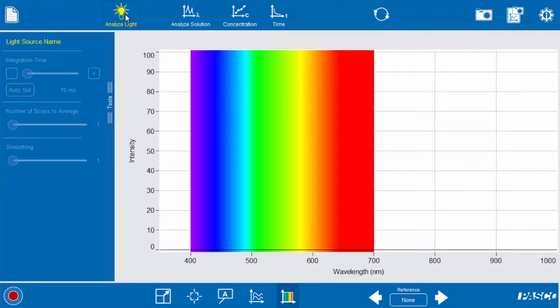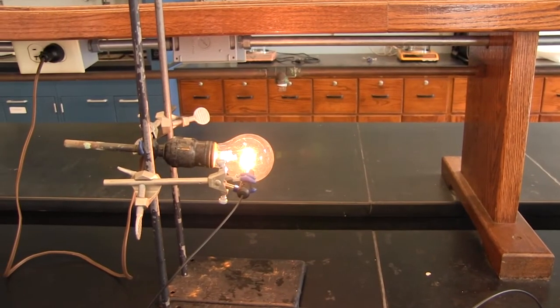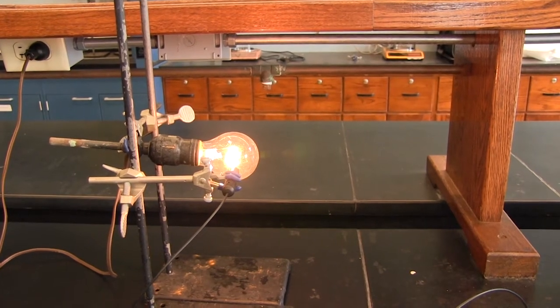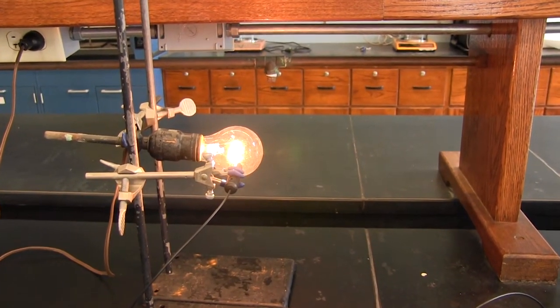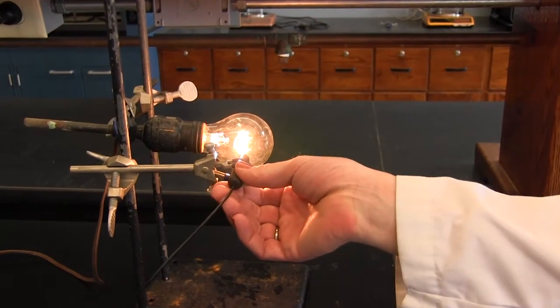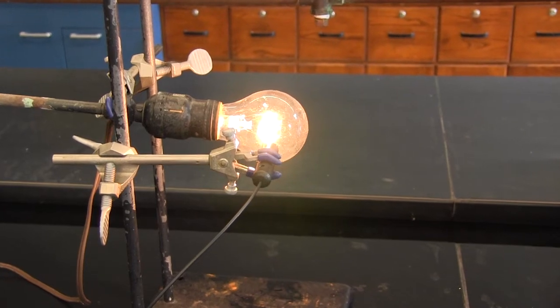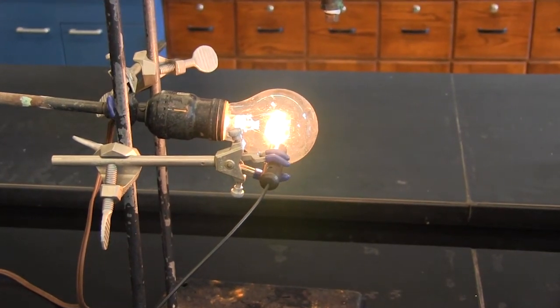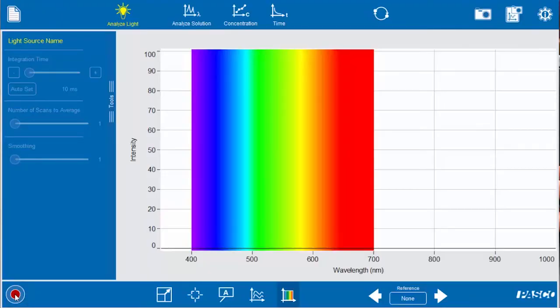So we have here a regular old-style incandescent light bulb that we used to have in our homes, the very energy intensive light bulbs, and you can see we have the top end of the fiber optic probe in a clamp pointing at the light bulb.